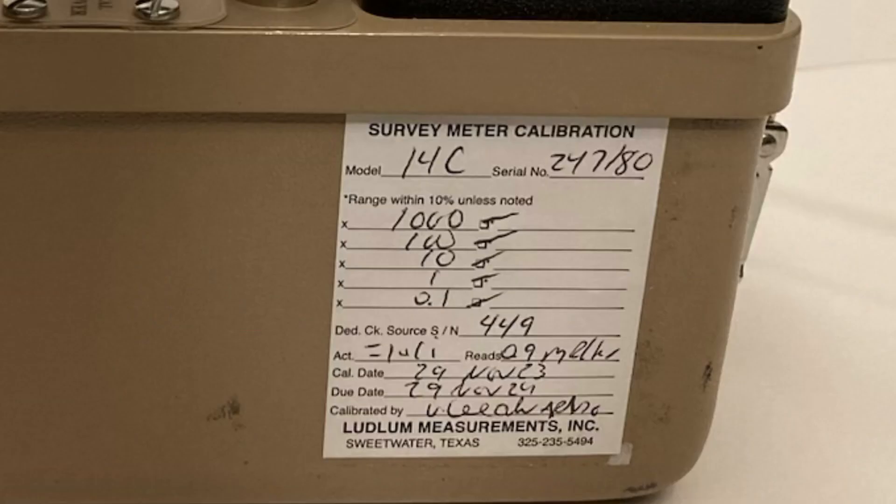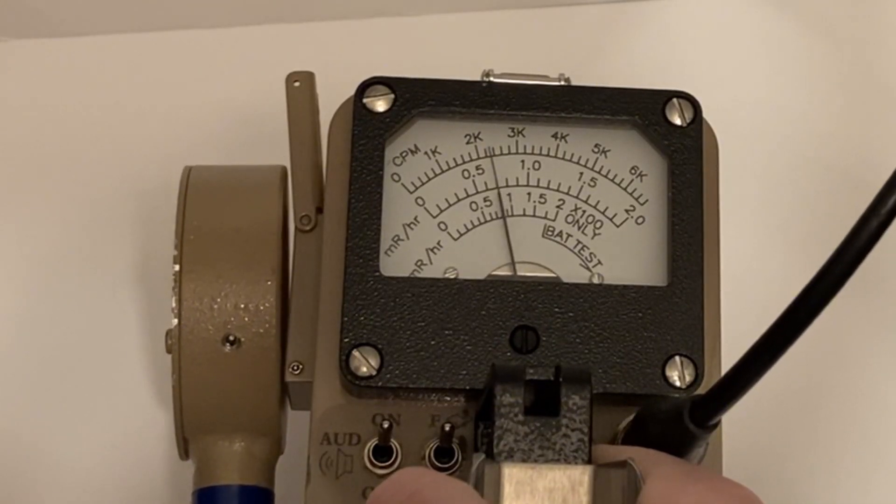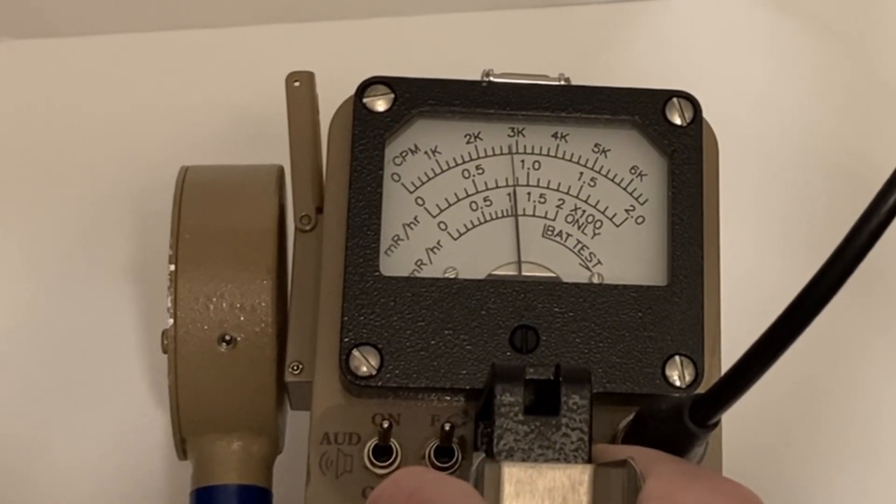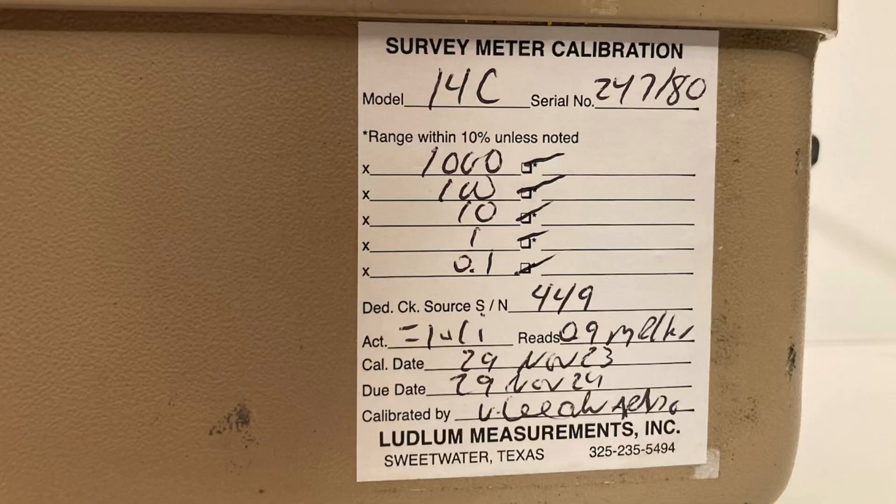Turn the instrument over and look at the calibration sticker. You will see a value, in this case 0.9 milliroentgen per hour. Inspect the reading on the dial. As long as it is within 20% of this, the instrument is good and ready for use. If not, the instrument may need calibration.